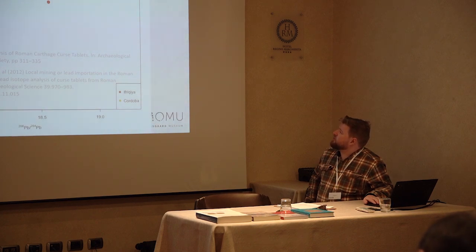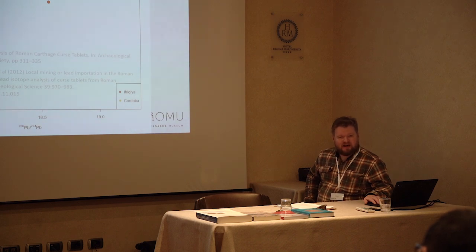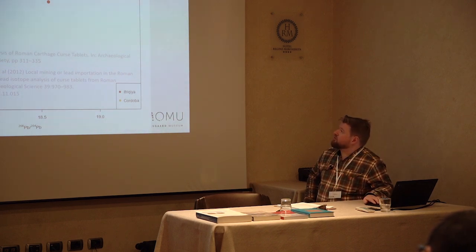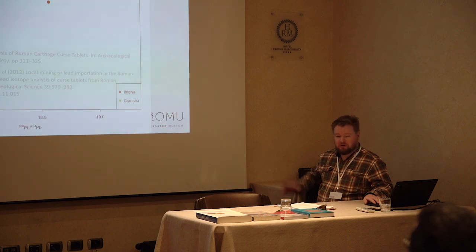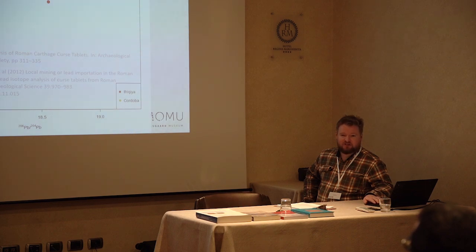And this is just to show our dirhams in relation to some other lead artifacts from the same area. What's really surprising is two of those from Carthage are right smack bang on the two from Cordoba, so it's making my head a little bit fried. But the rest of the artifacts made in Tunisia are in agreement with our dirhams.